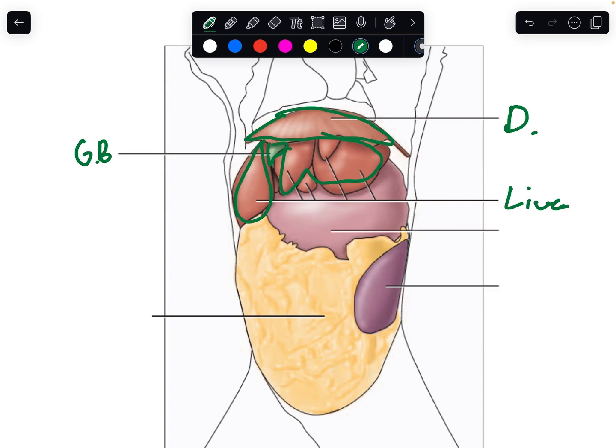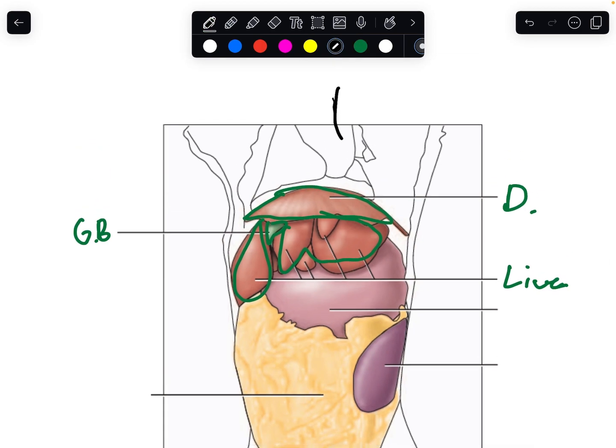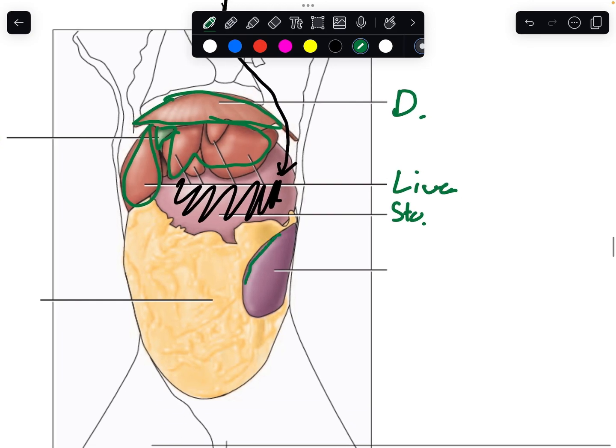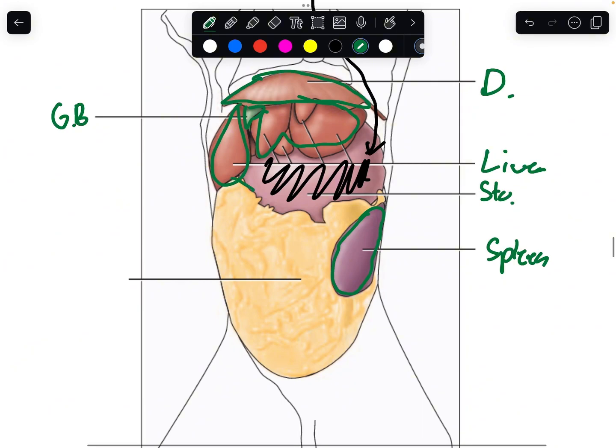So again, the stomach, right? Behind the trachea, goes to here, boom, we meet the stomach. So this right here is the stomach. This little organ-looking thingy is the spleen, and this yellow spot, the huge one, is the greater omentum.